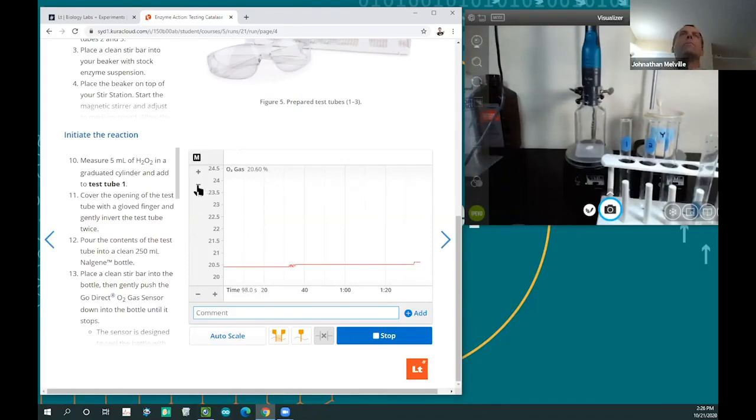There we go. And this reaction will last for, normally do this first reaction for around 200 seconds, so 3 minutes and 20 seconds. If you're ever doing this experiment, it's really important to proof the yeast or to proof your enzyme to make sure that you get a nice response. There we go. Now we're beginning to go up. Very nice.